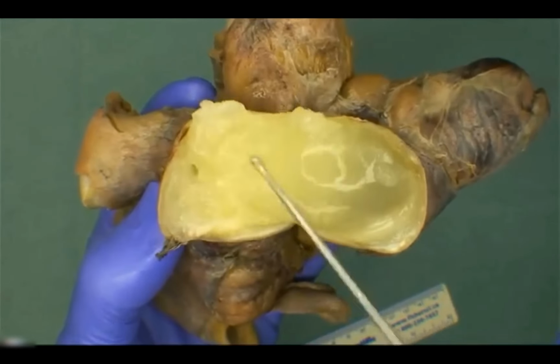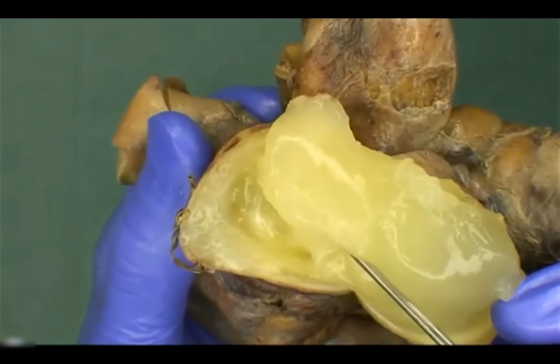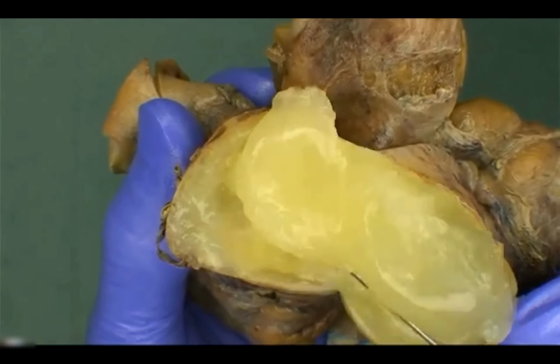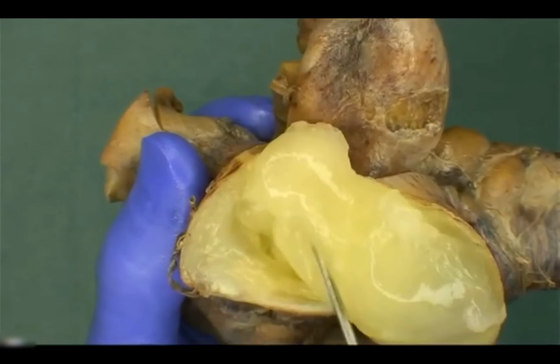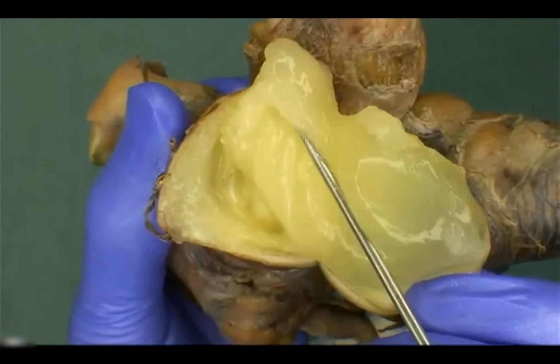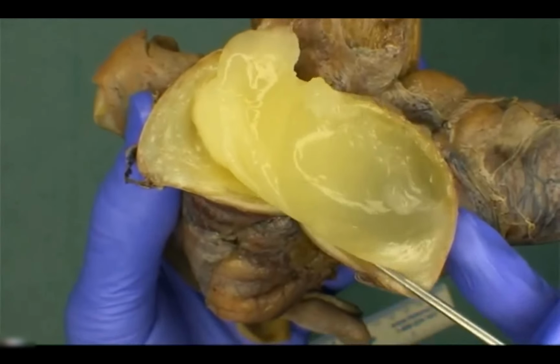That's good. It's very much in there. Can we take a peek at the lumen? Is it easy enough? Don't want to disrupt it too much. Yeah, so I think here is probably the closest I'm going to get to actually showing the lumen. The wall is very thin. We've got some of this gelatinous mucinous material kind of adherent to, and I think as I'm getting it into about here, I think that's the extent of the lumen that I can tell based on this slice. Okay, good. So there's no hemorrhage. You're right, because that would be much more red and brown. Coloration-wise, it's pretty homogeneous, and the lumen is definitely filled with a lot of this mucoid material.